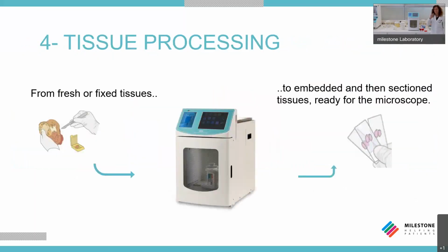The further application you can do in COS is tissue processing. This one as well is a very common application for any laboratory. Tissue processing describes the steps required to take human tissue from fixation to the state where it's completely infiltrated with a suitable histological wax and can be embedded, ready for section cutting on the microtome.